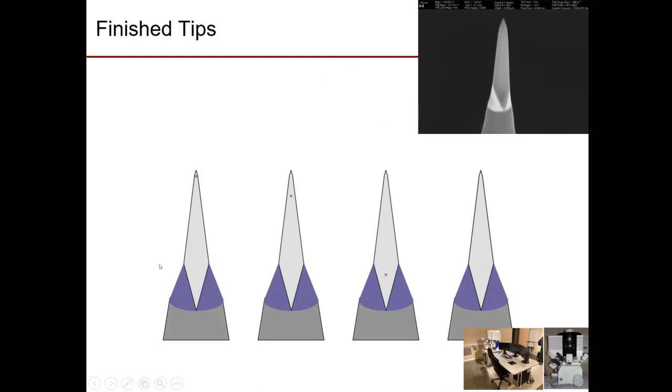Very good. So in close-up, this is what one of these needles would look like, and your concern in producing these is to position the feature of interest within the easily accessible volume of this needle, which means close to but not at the upper apex. Throughout the last parts of this positioning, where we are producing this final cone, we use low voltage focused ion beams, meaning low accelerating voltage on the ion beam, to minimize surface damage and implantation. We can handle those problems to some extent in data analysis, because being a volumetric data set, we can see the gallium implant and try to exclude it and the area around it, but it's better to not destroy portions of your specimen to begin with.